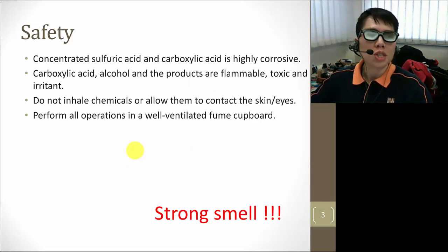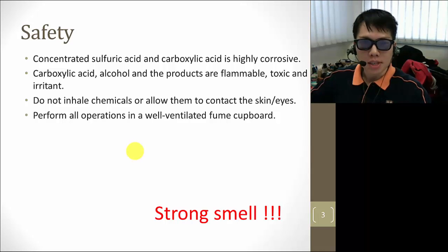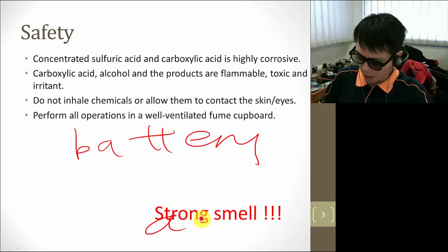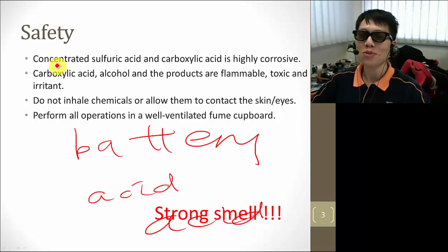In this reaction, you'll be using a lot of corrosive reagents such as concentrated sulfuric acid, also known as battery acid. The carboxylic acid that you are using in this experiment is also highly corrosive, so do take note, do not come into contact with them. Battery acid. So this concentrated sulfuric acid is highly corrosive. It can even burn a hole through your latex glove that you are wearing. It won't help. You get this burning sensation and your fingers will feel hot.